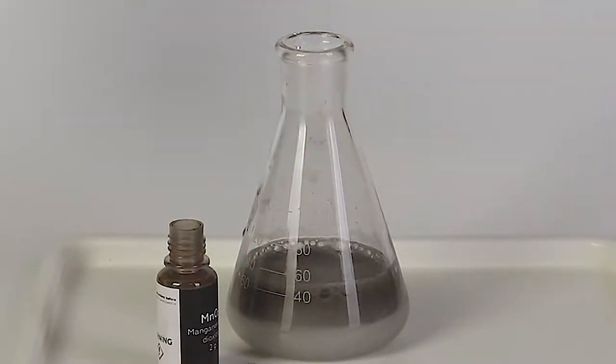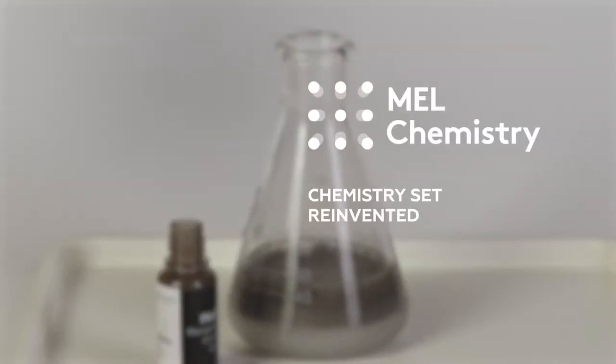For safety reasons, extinguish the splint in the bowl of water once you've finished the experiment. Learn more about this experiment on our Mel Science website.